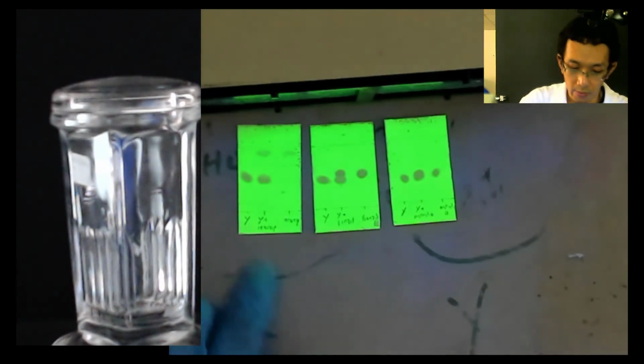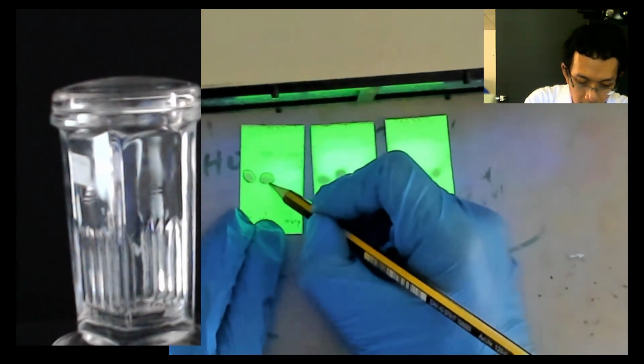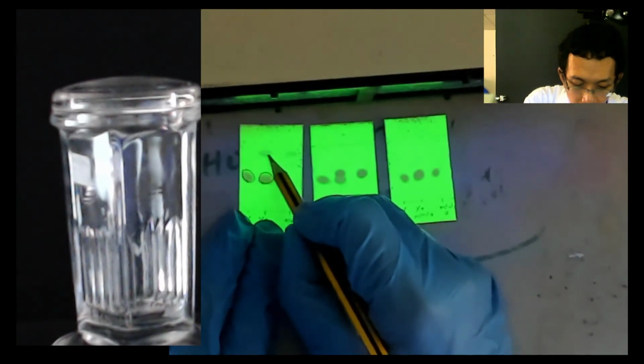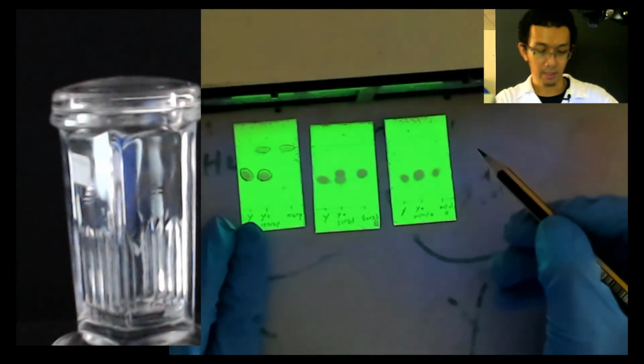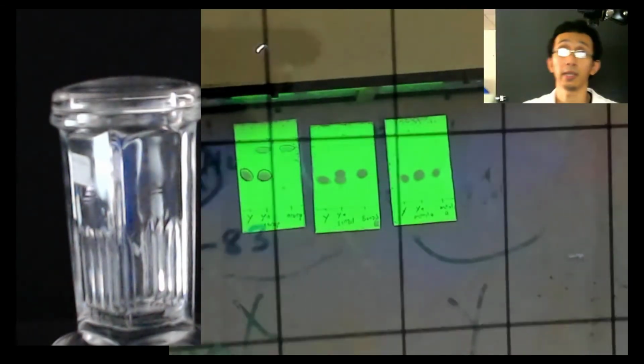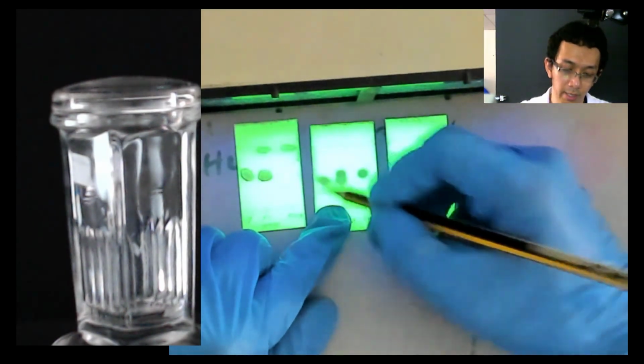Okay, so now, what is this? So you have here, actually you have something here like this, something here, you have something here. It's good if I wear the, what we call this thing. You see, I have this plastic I put in front of me, basically to avoid this UV radiation. That's why when you use UV, just use a short period, and wear gloves.